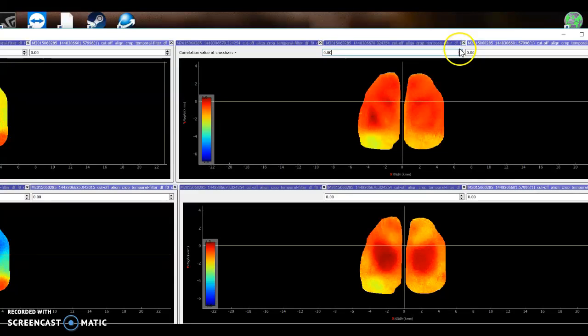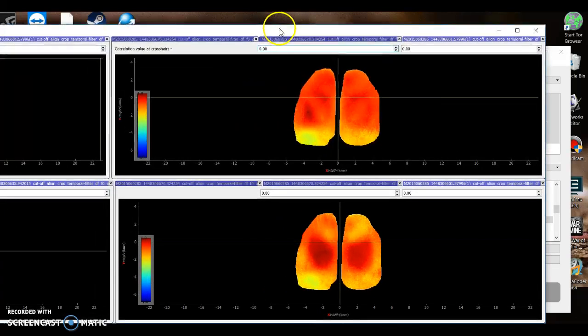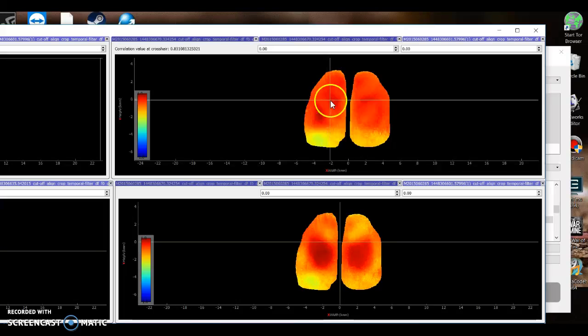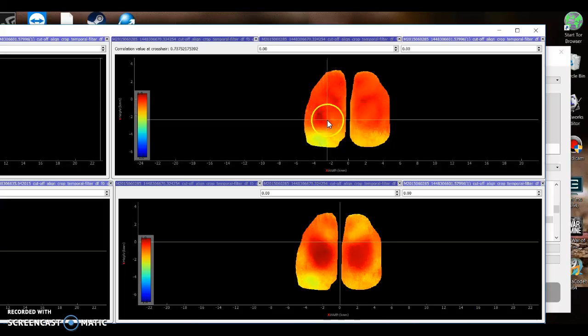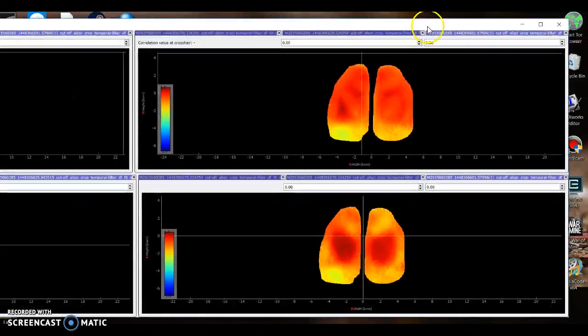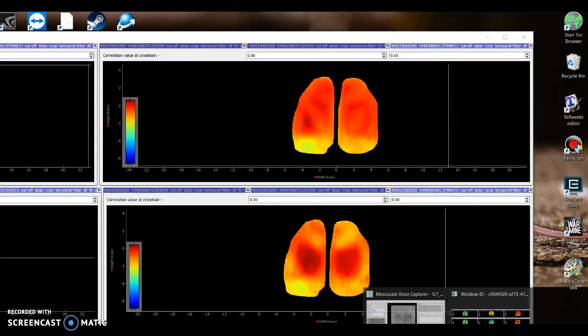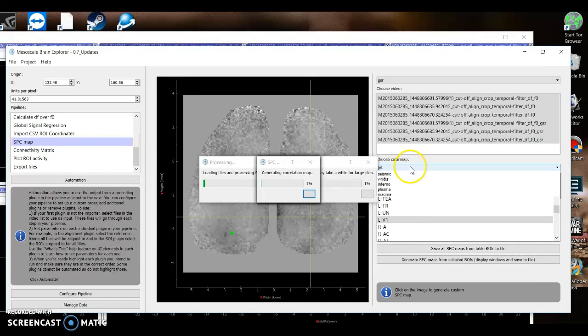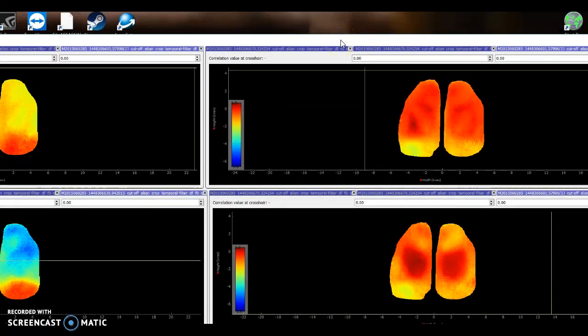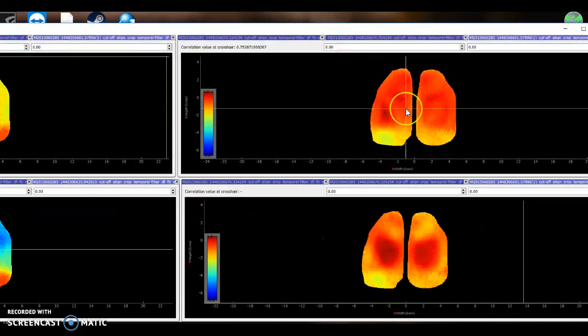It doesn't do anything yet, but what this will eventually allow a user to do is to specify the range that's visible. So you can imagine the upper range being 0.5, and then only correlation values below 0.5 will be viewed. And as you can see in the top left, the correlation value as you hover over this is also displayed. And of course, this will be savable like the plots that you've seen already, and the color map that you save won't be saved with it, so you can change color maps easily and on the fly. Like the data, the array that makes up the color map you save, not the actual color data itself.